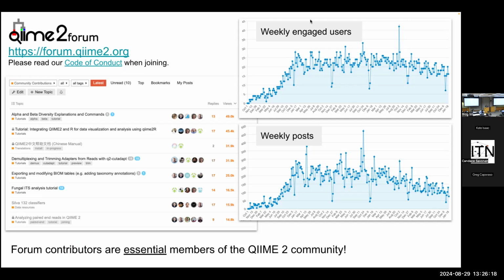And then we have some resources in there that folks in the community have shared. This is a list of some of the most popular ones. You can see this was a post that a student put together and talks about alpha and beta diversity metrics and gives citations for all of the metrics that we have in QIIME2. And this post has been viewed over 49,000 times.